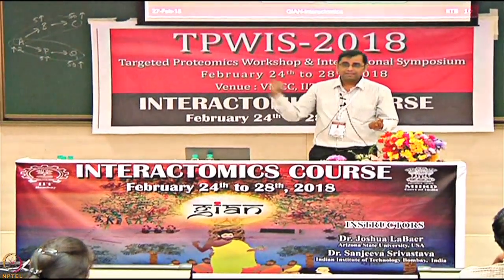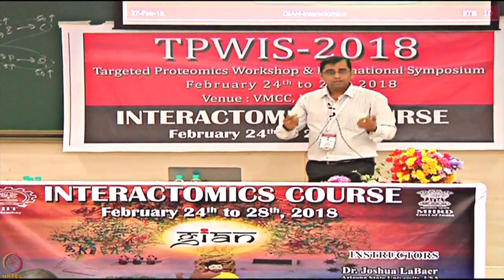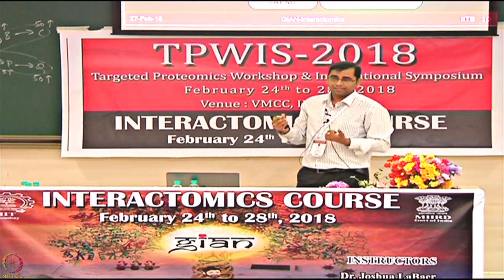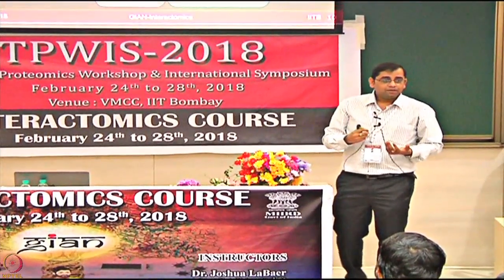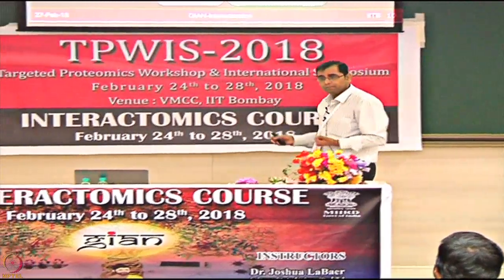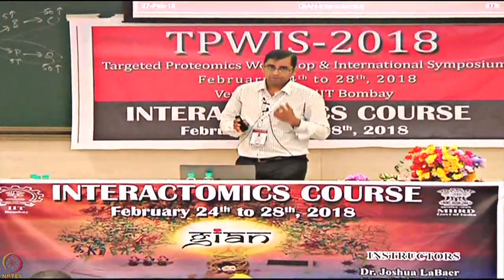They will take BSA, anti-BSA, or if you tell them there are 5 more interesting proteins to test out, they will take those highly abundant proteins and robust antibodies to test those assays. And these things are usually not good, because when you want to try out your actual experiment, which many times depends on low abundant proteins, and the antibodies are not so great for them, then your assays don't work as robustly as you would have seen at the proof of concept level.